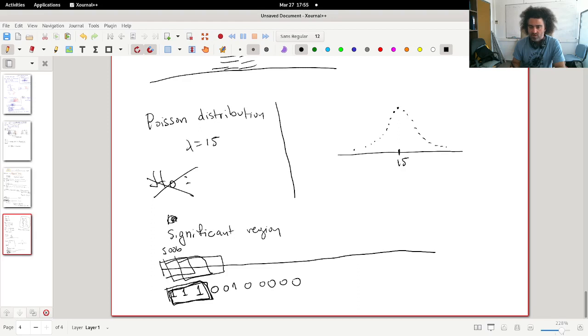Now, this region does not have 500 times 3, so this region is 500 base pairs, the first one, so this one. But the next to that is overlapping with the first one, and this one is overlapping. So if this step from one region to the other is just one base pair, the fact that we have 3 consecutive significant regions would mean that this region would be 502 base pairs long.